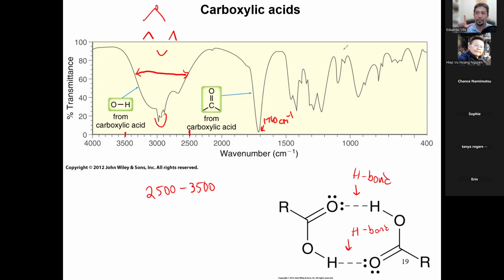The wizard beard is an OH. Is that what you're asking? Yes. Okay. Yeah. The wizard's beard is an alcohol, right? Remember, alcohols are very strong polar bonds, so they are found at a very, very high wave number.